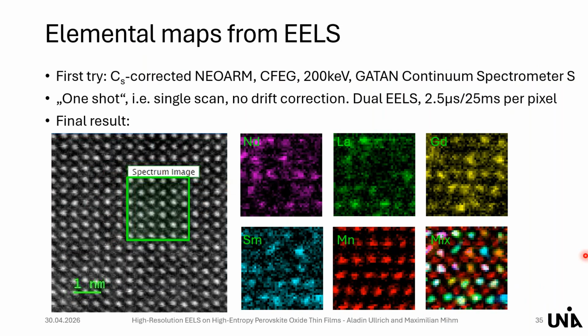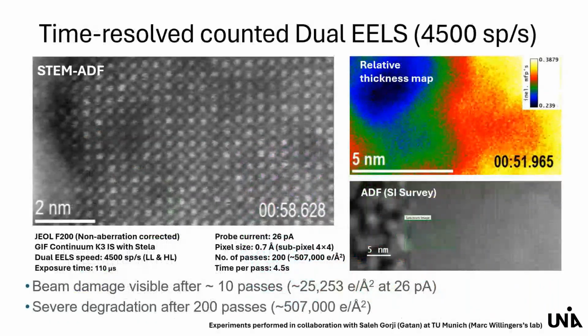So to shed more light on this sample destruction or the stability of the sample during these maps, we were luckily invited from Gatan to go to the lab of Professor Willinger in the Technical University of Munich with a DigiScan 3 system and latest direct electron counting systems to record dose-fractionated multiple frame acquisition technique to get some time-resolved mappings of this sample to see whether this is stable and to confirm our result. So this we can see here.